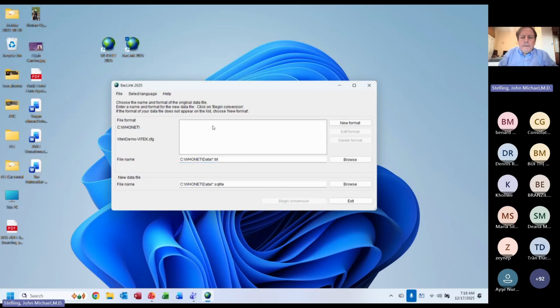Okay, so here at the top, I choose the language that I want to translate, but the box is currently empty. Before I get started on that, let me just make sure there's nothing in the chat.